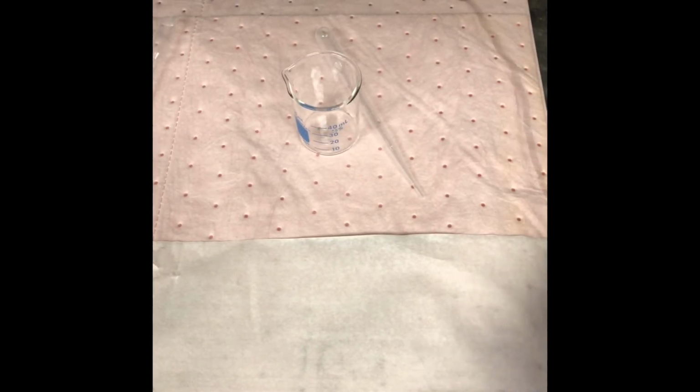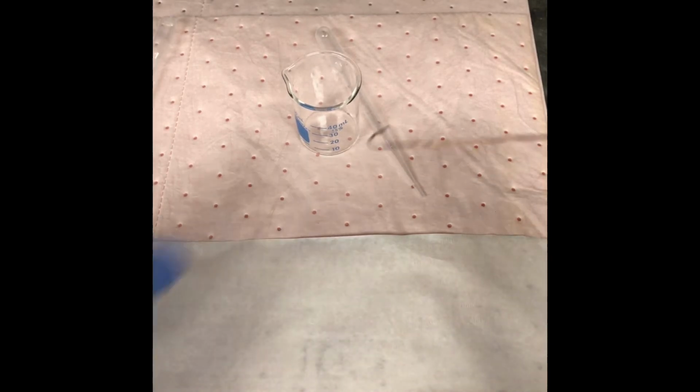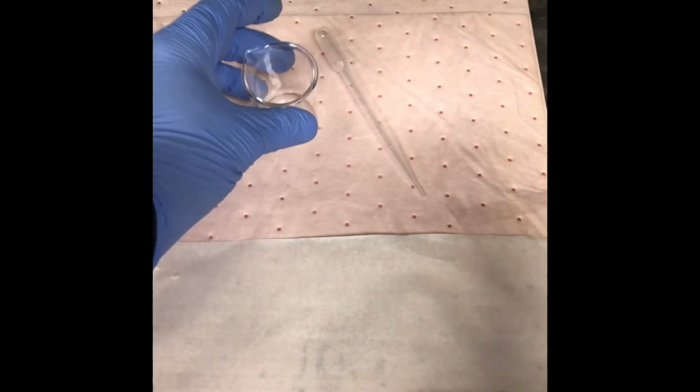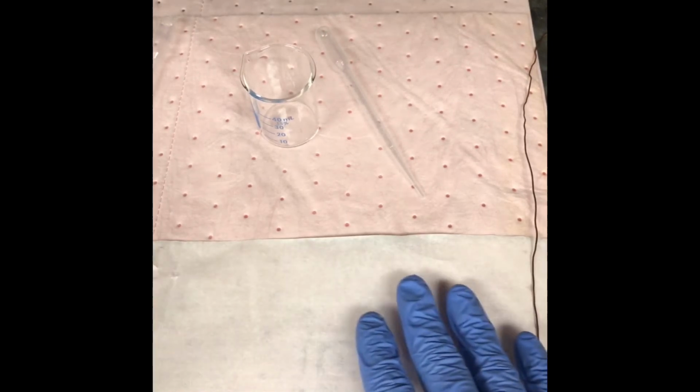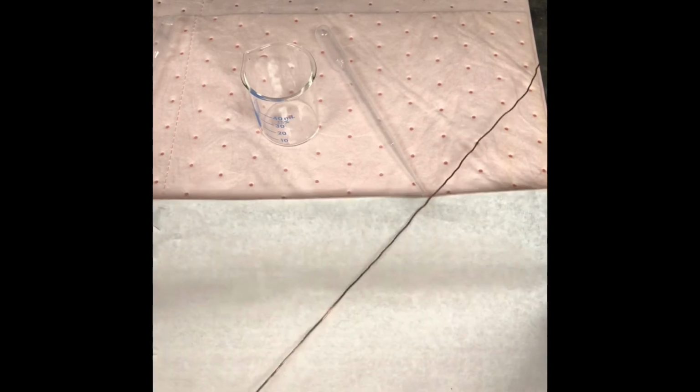Okay? Now when you go to pull this nylon out of the beaker when it's being formed, you could actually pull long strands. We have a little competition normally where you do that. But today we'll just pull out a moderate length strand and we'll dry it on this piece of paper towel. We'll pause the video, and when it comes back, the nylon will be dry, and we'll test the properties of it. Okay? So here we go.